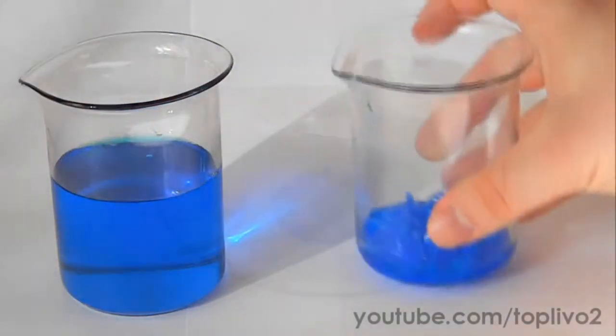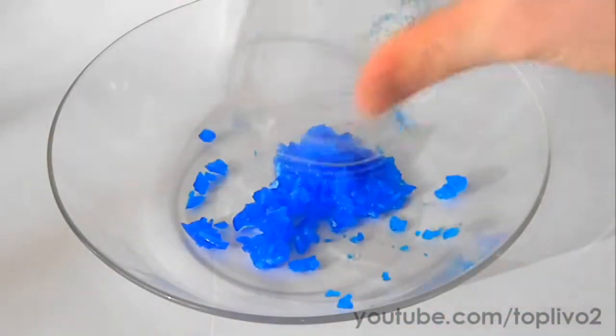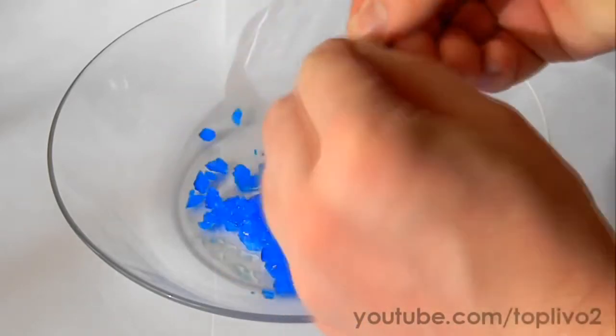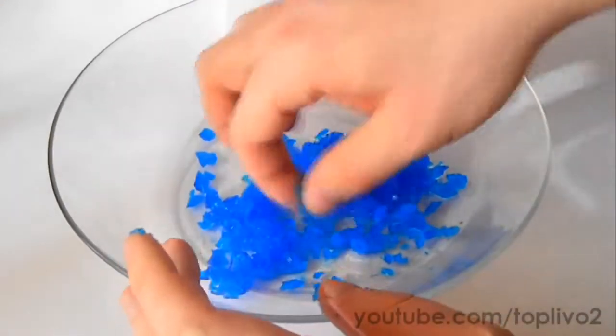Take any knife or other sharp tool and break apart the crystal mass. Once we have scratched it all apart, pour everything into a bowl. Choose a smooth and large crystal. I advise you not to handle the crystals with your bare hands — it's better to do it with gloves on.